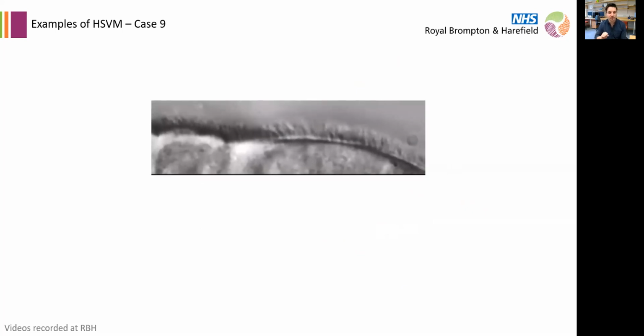So a little bit trickier again. I'm sorry, it's a bit blurry. Can you see here that something is not exactly right? It's not exactly about the pattern. It's a little more subtle than that. So it's actually slightly staggered.